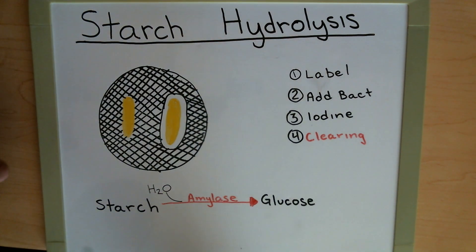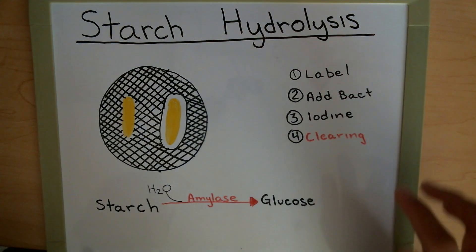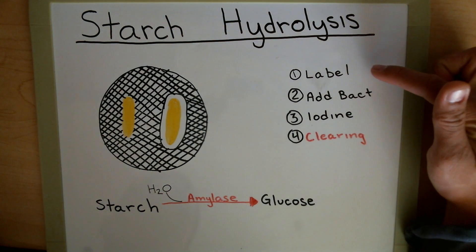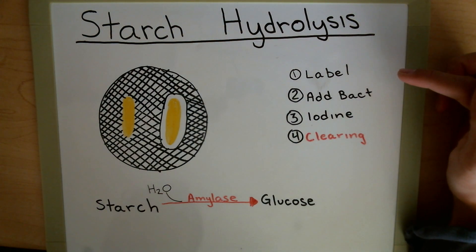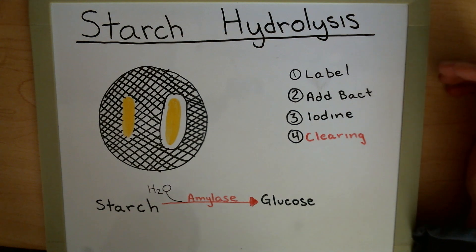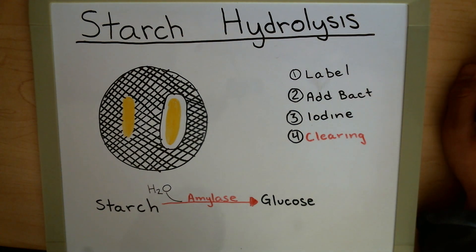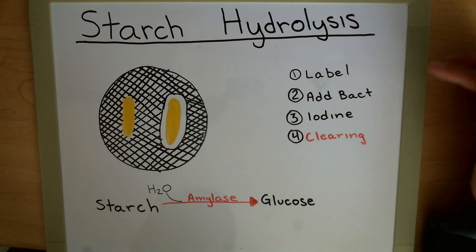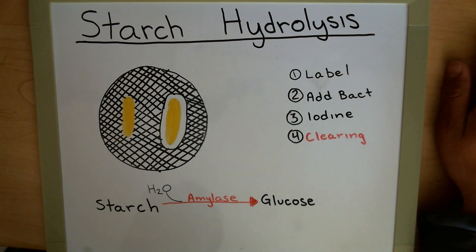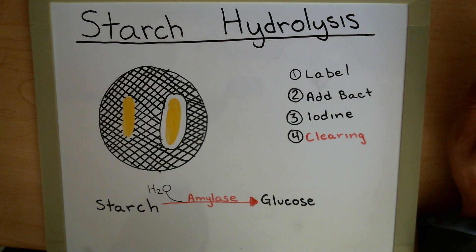The first thing that we're going to do is label our plate. This is very important because you're going to be comparing two different bacteria and you need to label which bacteria is which, because once you add the bacteria, incubate, and pull the plate back out, you're not going to know which one's which. So labeling is very important in this one.